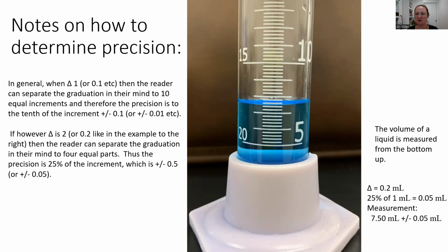But sometimes you might run into a measuring device where the hash marks are not at every 1 milliliter or every 0.1 milliliters, but instead might be at every 2 milliliters or 0.2 milliliters. So if your delta is 2, or for example 0.2, like we would see over here, then our brain can only really estimate 4 chunks in between those hash marks. So the precision is actually 25% of the delta value.